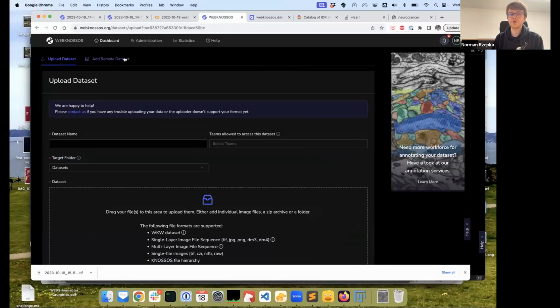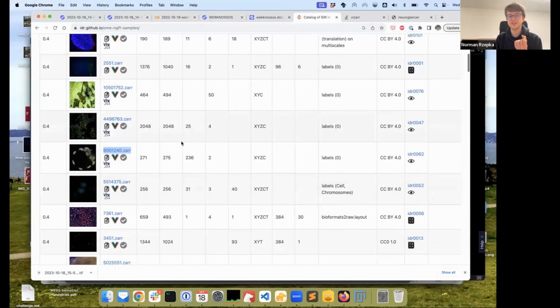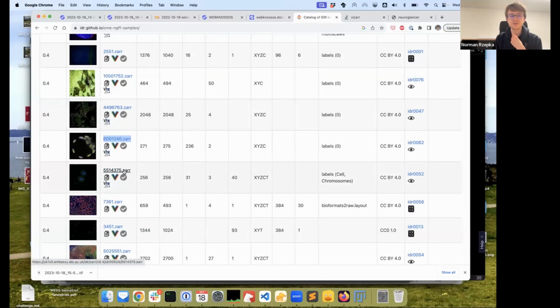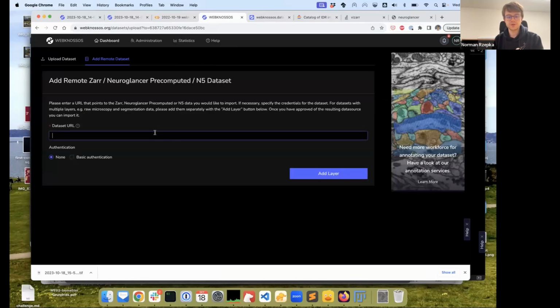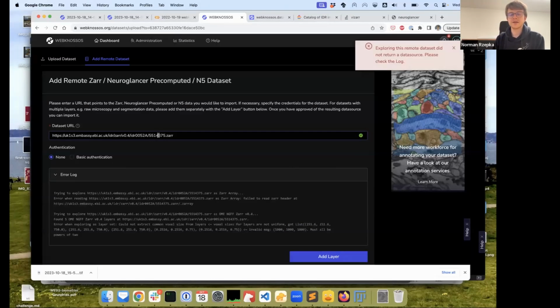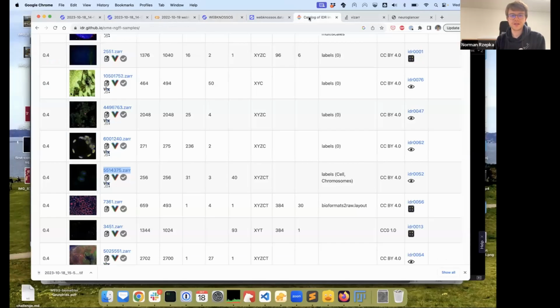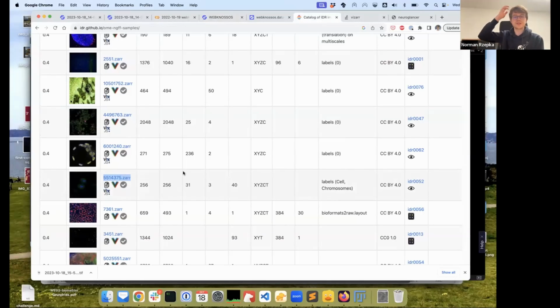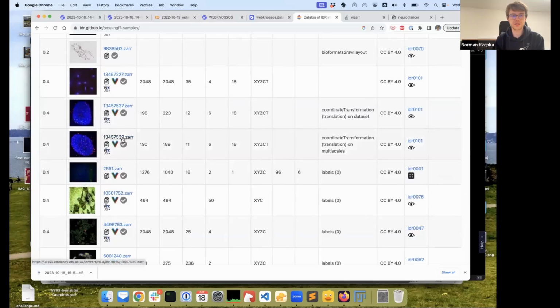It's not fully supported. One of the limitations, for example, is that we don't support uploading yet. But if you do happen to have a data set in Zarr which has time series data, then that should work. I haven't tried it with this one, but let's see if this works. Upload is coming in. It doesn't work with this. Okay, let's try another one. Upload is coming in one of the next releases, so probably before the end of the year we'll also have upload support for time series data.